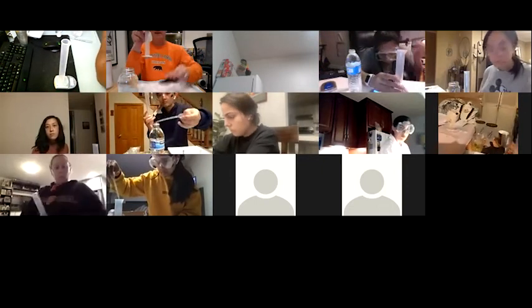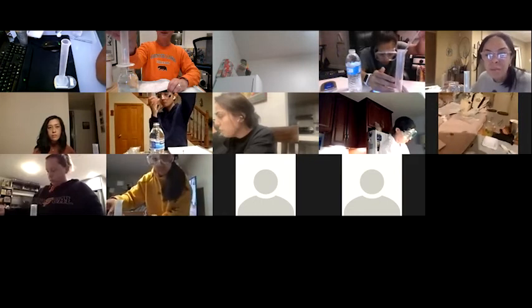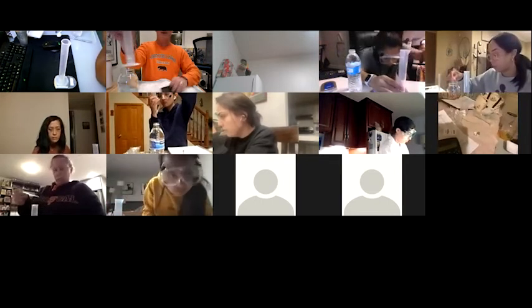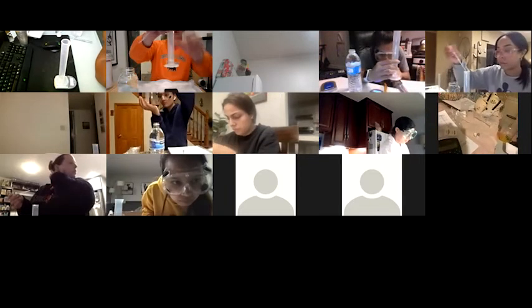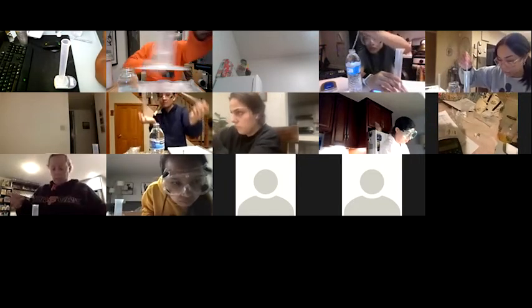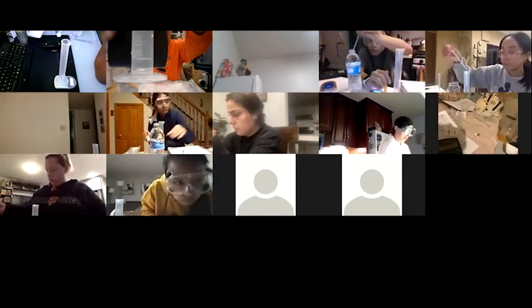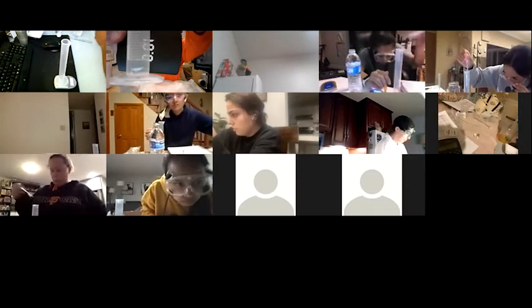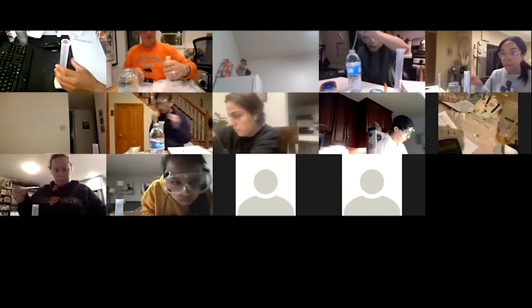or something like this. It's really hard to read the numbers because it's a clear container, it's got clear numbers. If you put something dark behind it, notice how much easier it is to read. So that's pretty much impossible to read, and now that's a lot easier. I don't know if you can see how much easier it is, but take my word for it, it's easier.